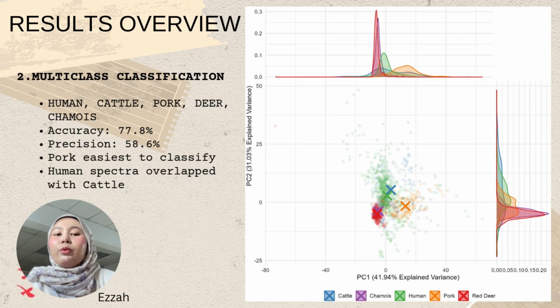However, there was noticeable confusion between human and cattle bone because both come from large mammals and are dominated by hydroxyapatite, hence producing overlapping NIR absorption signals within the spectral range. So the model misclassified 45.8% of cattle spectra as human, but it dropped significantly to 9.4% when re-evaluated after pre-processing techniques to remove the unwanted noise from spectral data.